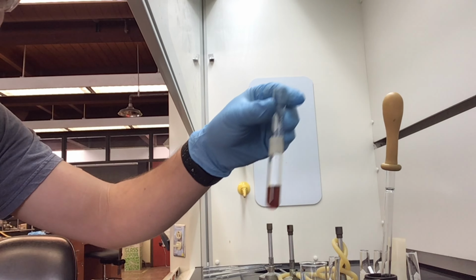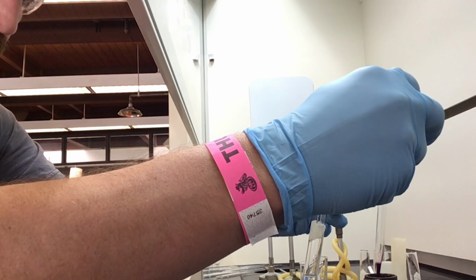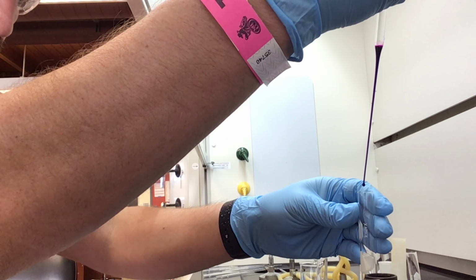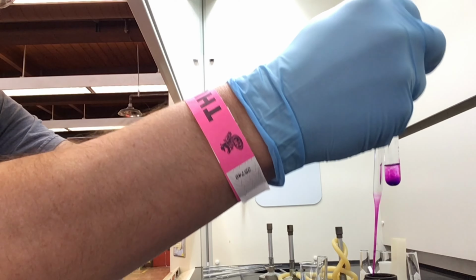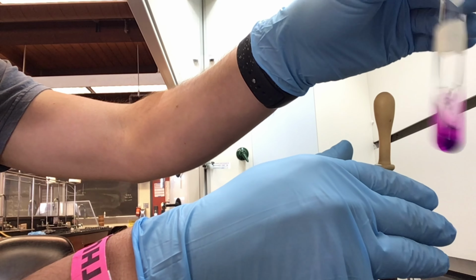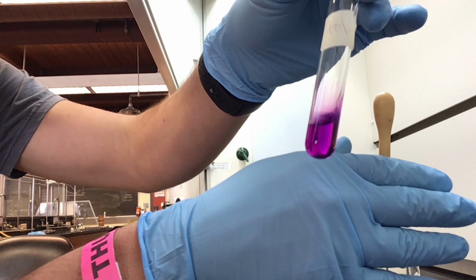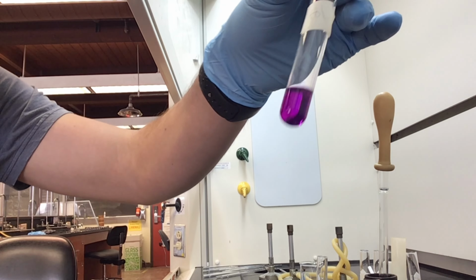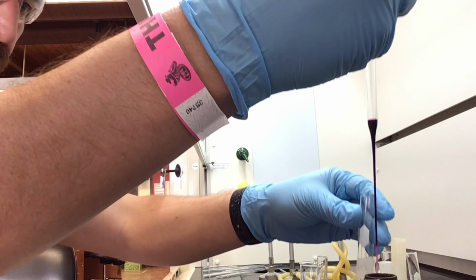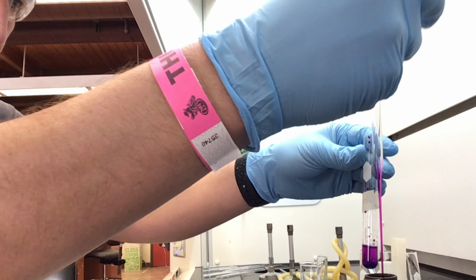All right, so now let's go ahead and set that aside and take a look-see at something that does not give us a positive confirmation of the presence of an unsaturated bond. KMnO4 does not react with this compound, and it stays that gorgeous purple color. Obviously it might turn a little bit more pink because it's a little more diluted, but it's still a pretty color. And yeah, there you go.